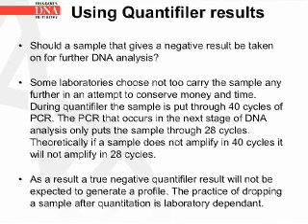Now that the quantifier plate is run and the samples analyzed, what do we do with those results? First of all, let us consider if a sample that gives a negative result should be taken on any further for DNA analysis. Some laboratories choose not to carry the sample any further in an attempt to conserve money and time.